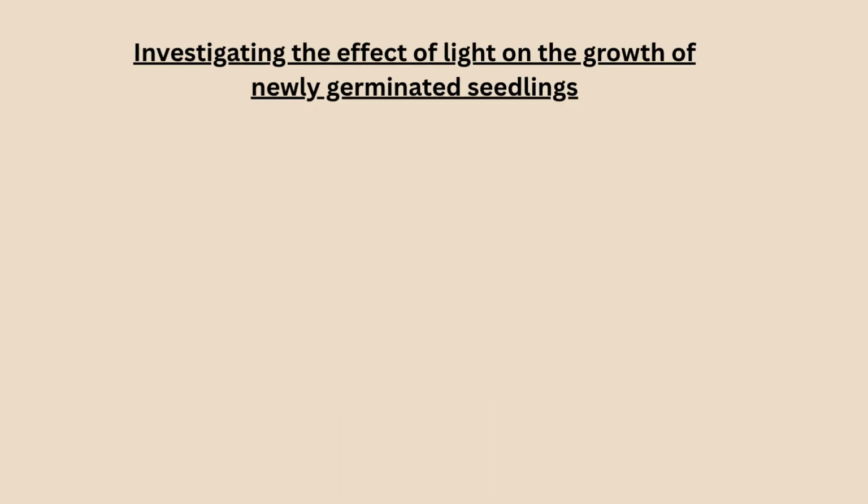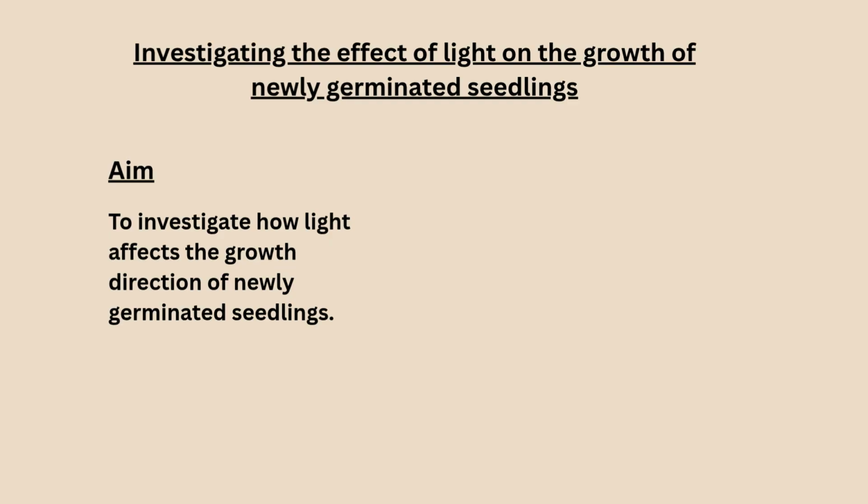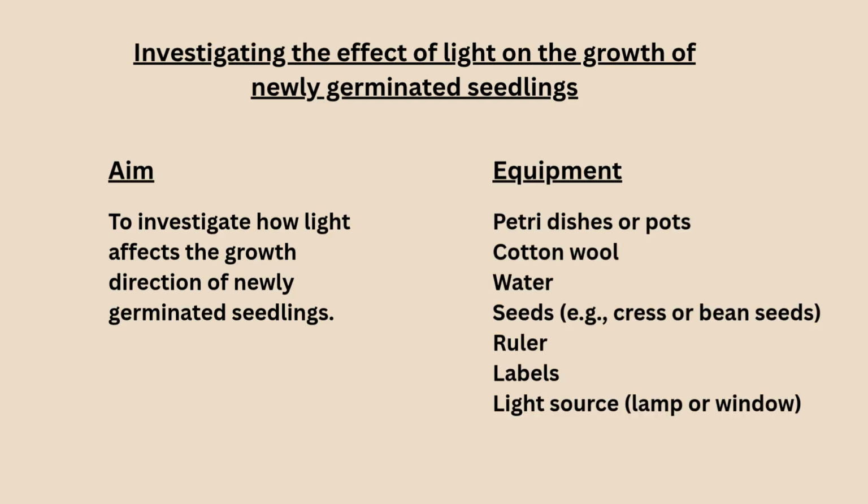So we will look at light first of all. Our aim is going to be to investigate how light affects the growth direction of newly germinated seedlings. And we have a list of equipment that we will be using.